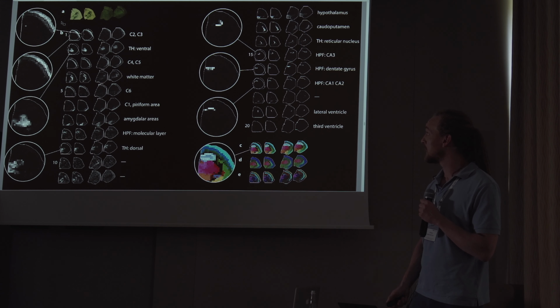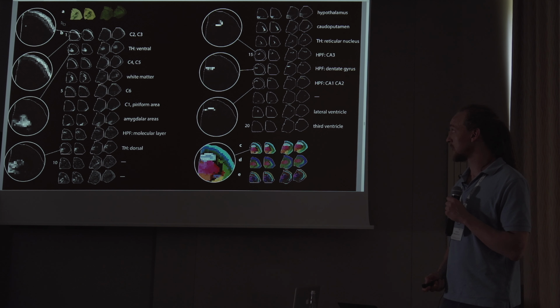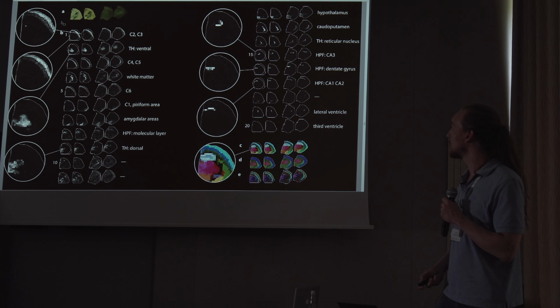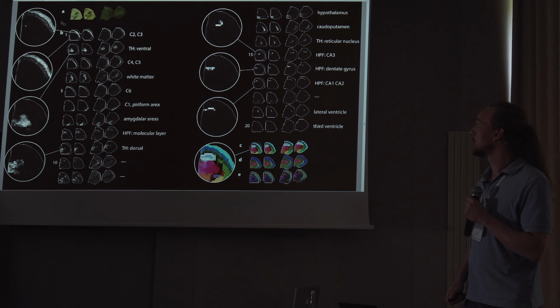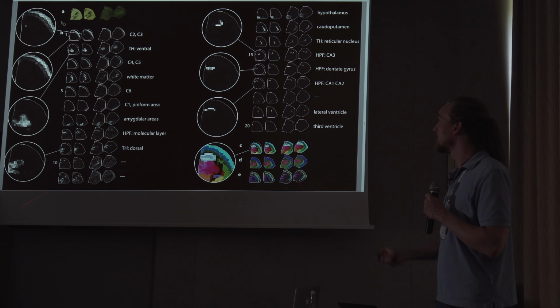To go on to further illustrate this, I would like to show these brain sample results, in which we now, in fact, only have 4 samples as indicated here. And we used 20 types, all of which I display here. I took the liberty and annotated the anatomical regions that are highlighted by these patterns in this column.